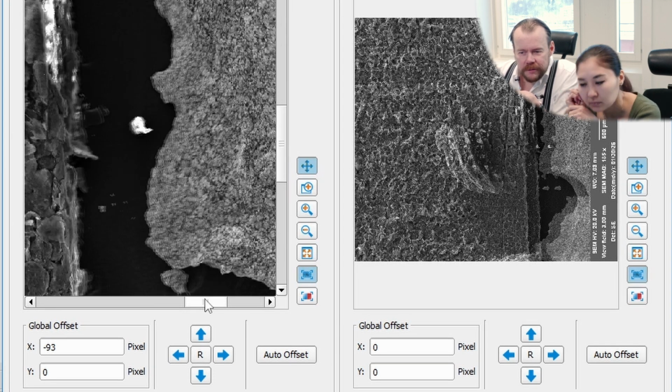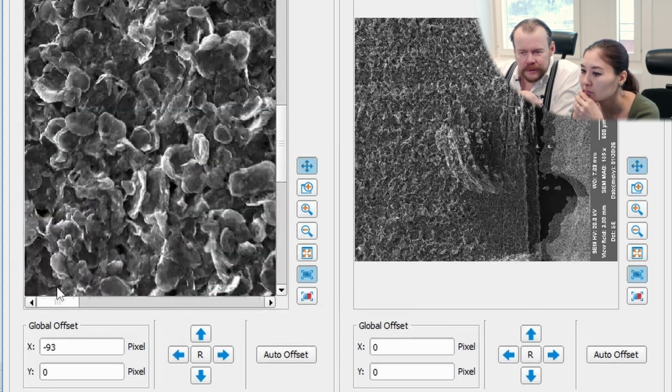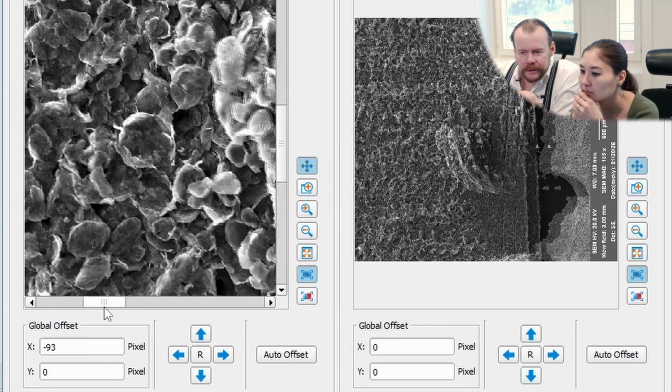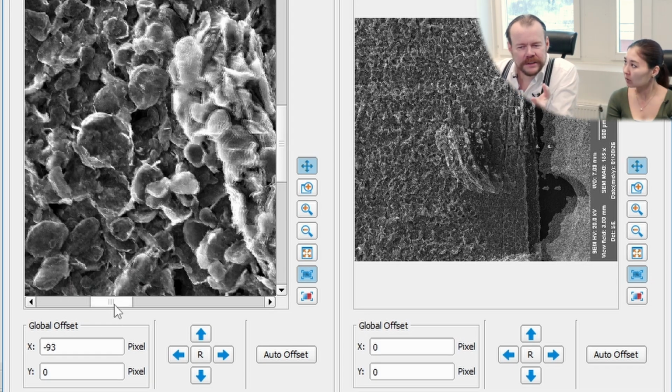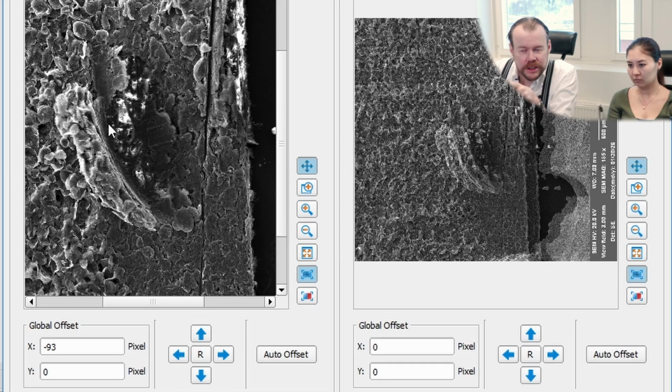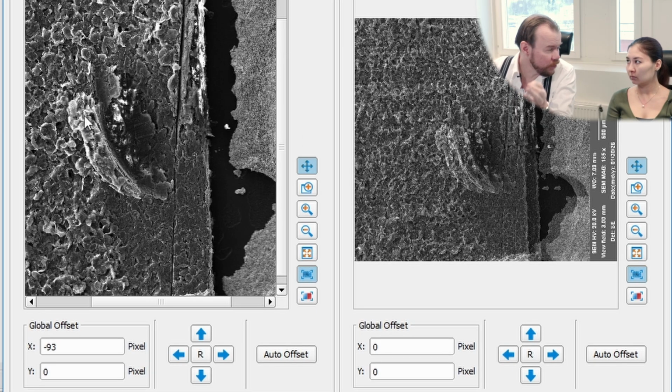But if I go over the image, you can see that over here it matches less. And that is because of this parallax thing. That is the thing the computer will use to generate the image. But what we want to do is match the same object in both images, and the thing that should be matched should be the central object of interest.